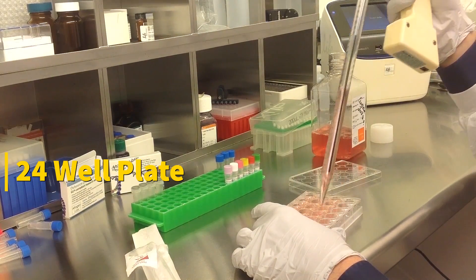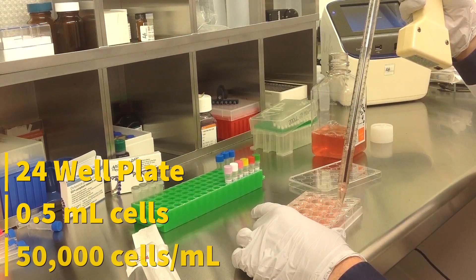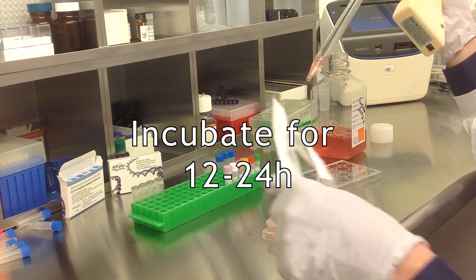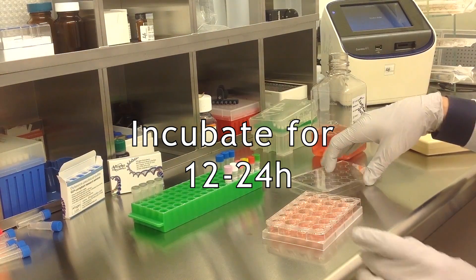Start by seeding 500 microliters of cells in complete growth medium into the wells. Cell density should be at 50,000 cells per milliliter. Incubate the cells for 12-24 hours before transfection at 37 degrees Celsius in a humidified carbon dioxide incubator.